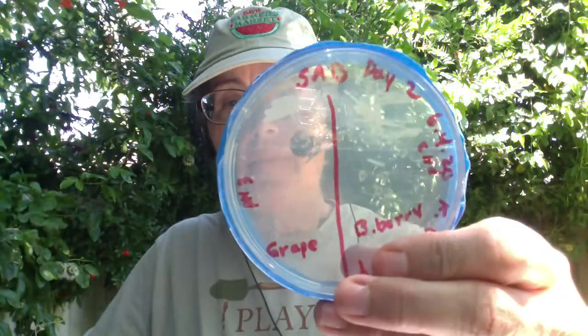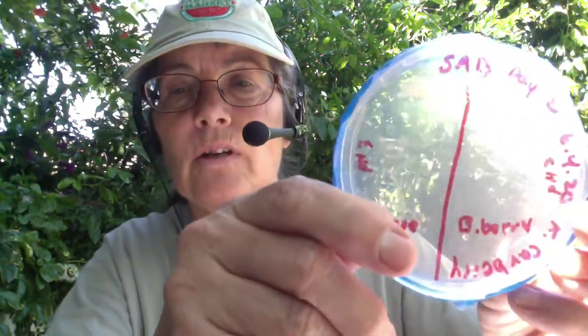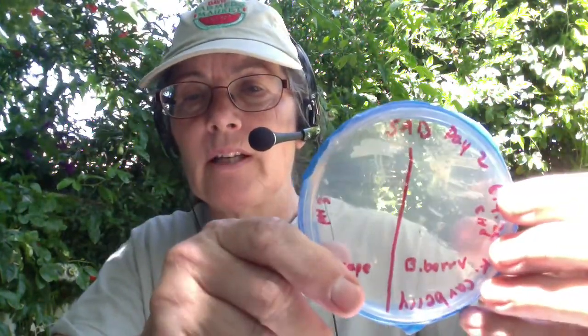And then as a follow-up, folks, after 24 hours of incubation, we took some of the fermented samples and we plated again to Sabouraud's dextrose media. And it's a little bit harder to interpret, but just as we saw with the TSA, you guys, it looks like some of our microbes are outcompeting the others, right?